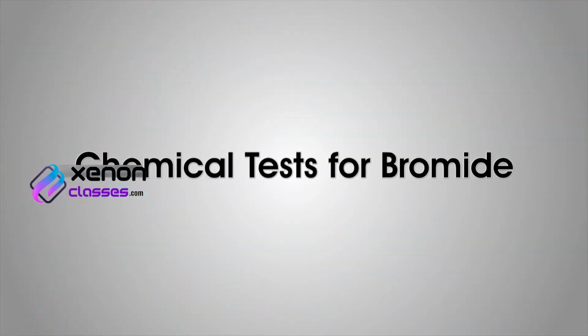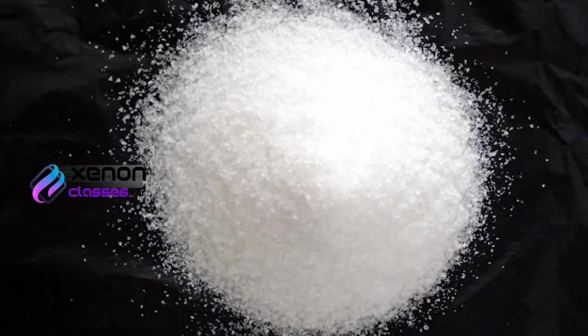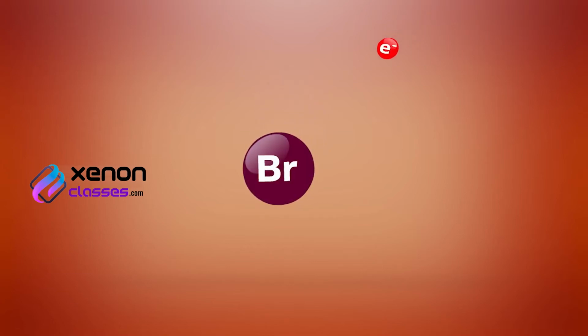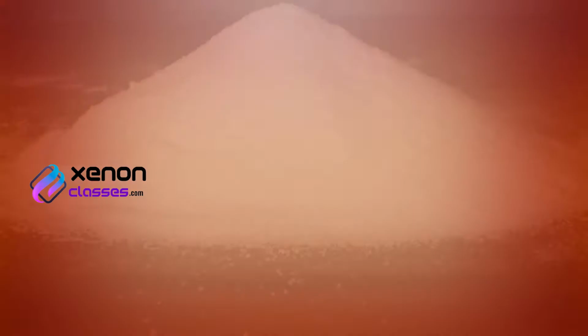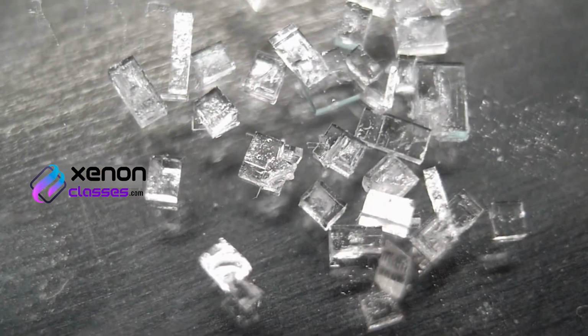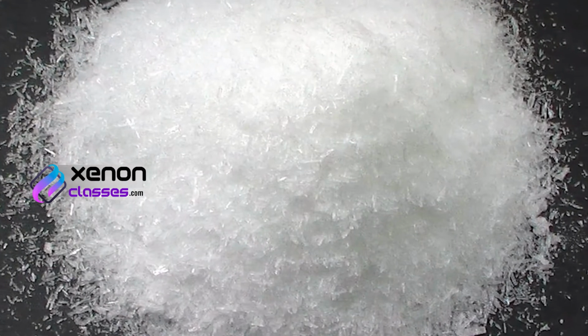Chemical tests for bromide. Bromides are chemical compounds containing bromide ions. The bromide ion is formed when the bromine atom gains an electron. Examples of bromide salts are sodium bromide, potassium bromide, and cesium bromide.